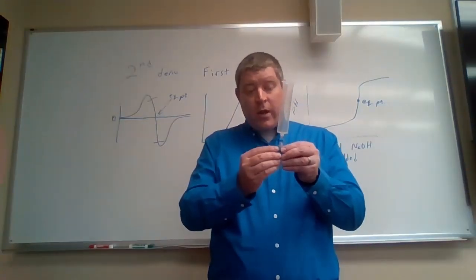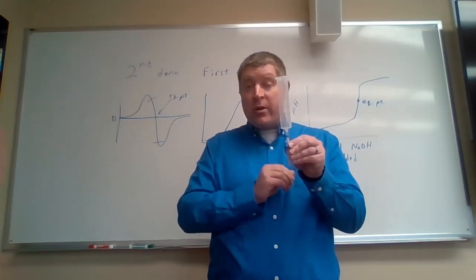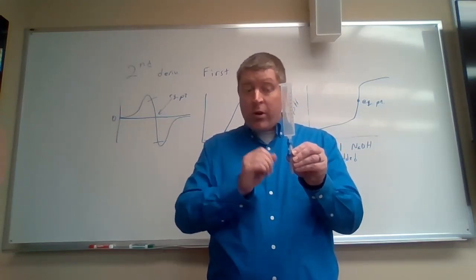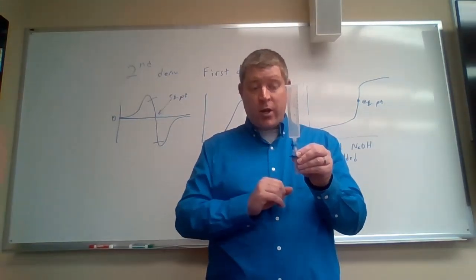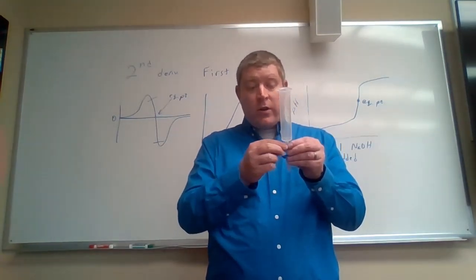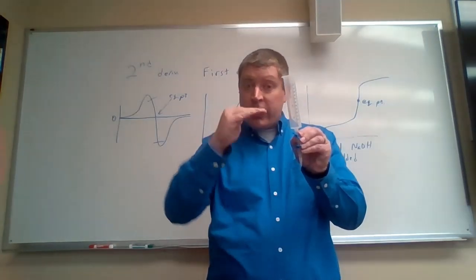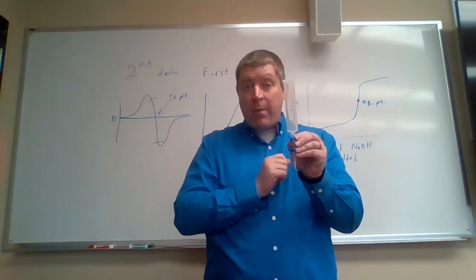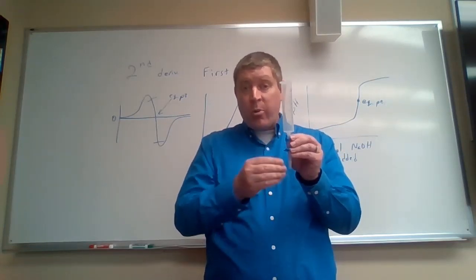You're going to use the bottom valve as on-off. It's either fully open, where the flow is going to go through, or it's fully closed, where the flow is shut off. The top valve you're going to use to control the rate. So you're going to very carefully adjust the angle of that top valve so that you set a flow rate of about 1 drop per second.